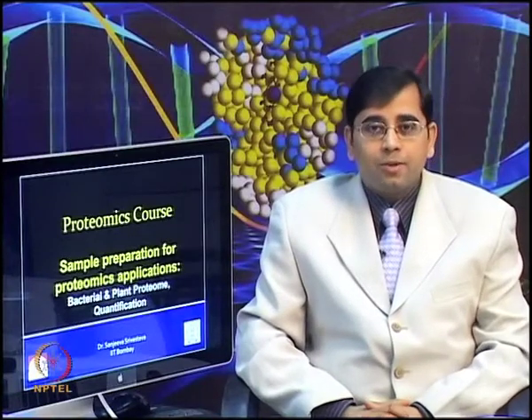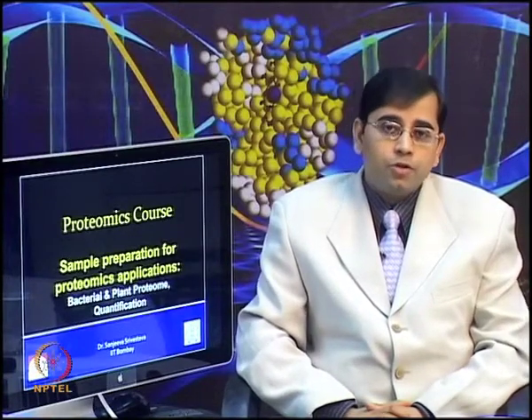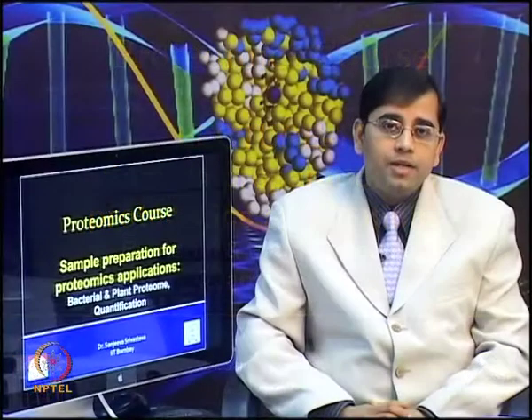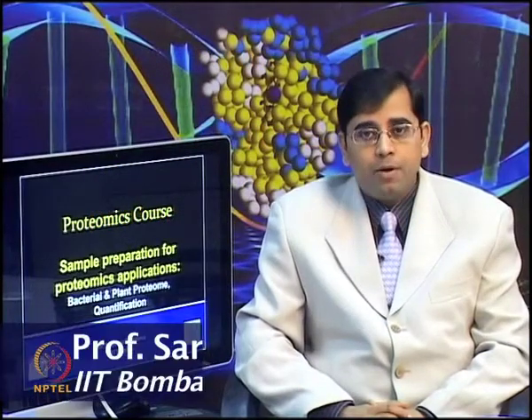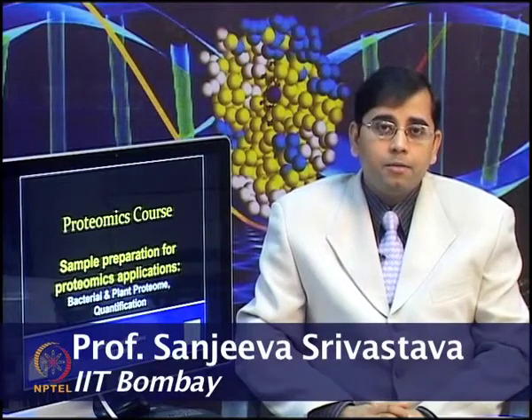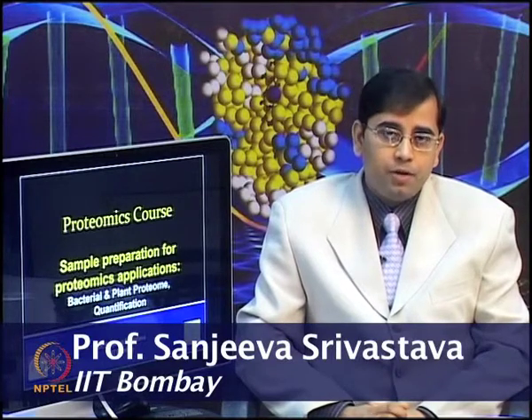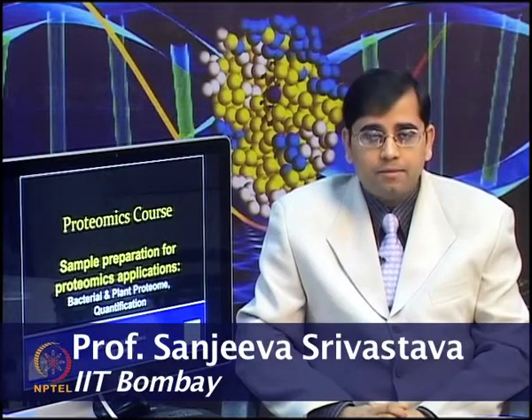Welcome to the Proteomics course. Today we will talk about sample preparation for proteomics applications with a special emphasis on bacterial and plant proteome analysis and protein quantification. In the last two lectures, we discussed different methods which can be used for a very good protein sample preparation for proteomics applications.